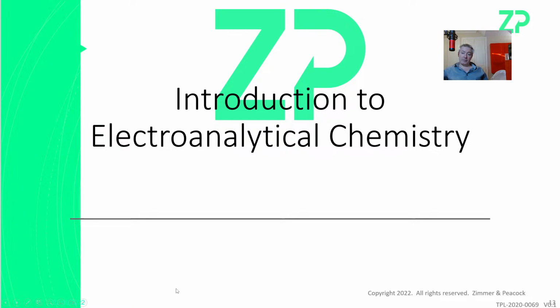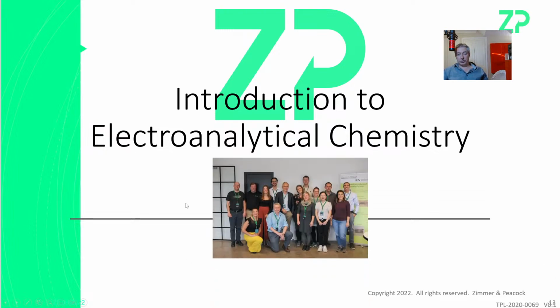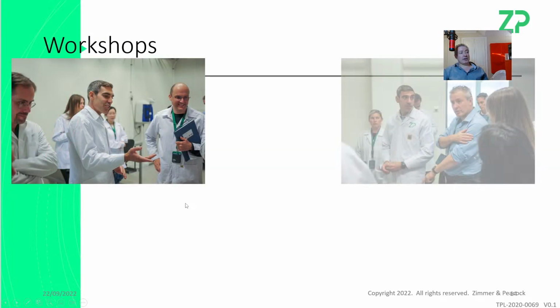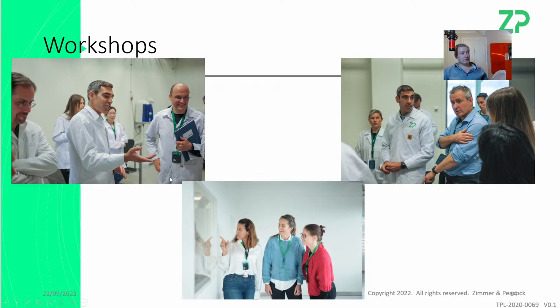I have mentioned that we've got a workshop with Technando in India, and we have workshops in France, Norway and the US. Those are all booked. We do these workshops, they're well attended, and they're quite practical. In this one, people made lactate sensors, oxygen sensors, and glucose sensors. They made their own sensors and tested them. There was a real smile on people's faces when you make something, test it, and it works. So I think it was well received.